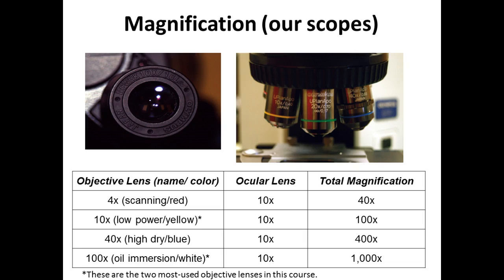When you're done for the day, you take lens paper, and you wipe off until you don't see any more oily residue on your lens paper. And then you put your microscope away. You don't have to clean it in between slides, right? That'd be a waste of paper. You clean it when you're done. So that way when it's sitting, it's not creeping into the lens and making it blurry. That's 1,000 times magnified, and even then is not going to seem like a whole lot when it comes to bacteria.